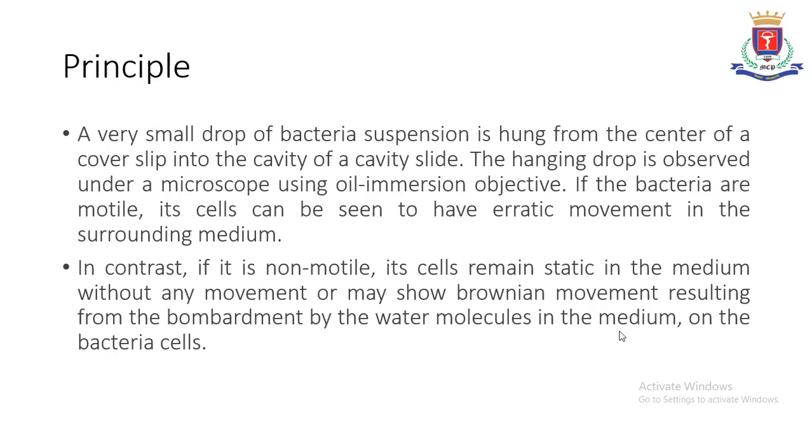Now we will see the principle behind this hanging drop technique. Usually what we do is we take a drop of bacterial suspension and put it on the center of the cover slip, and this cover slip is placed onto the cavity slide in such a way that the drop is not burst, and the slide is observed under oil immersion objective lens.